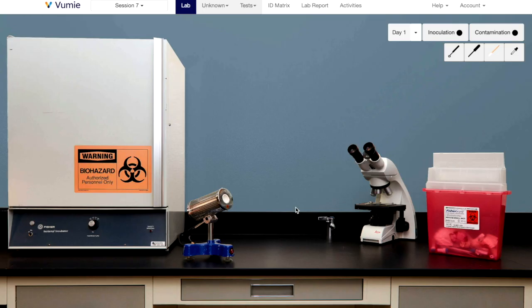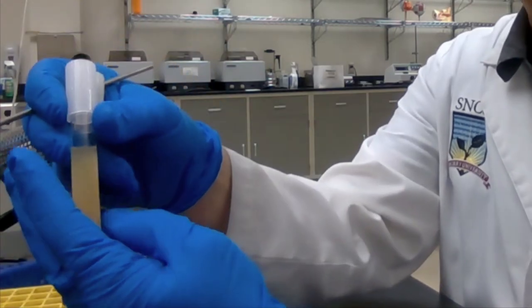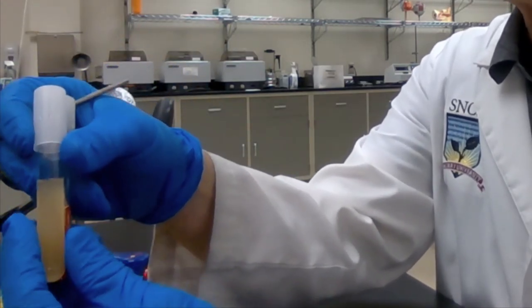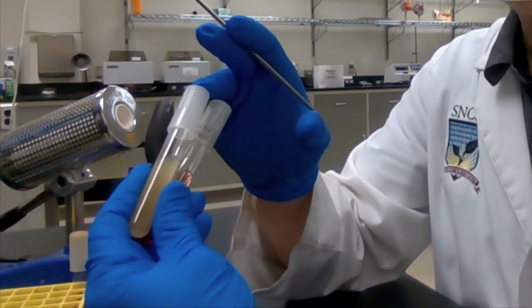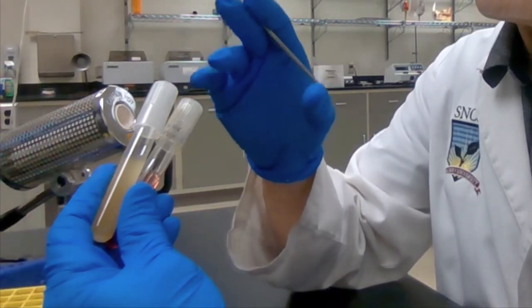This is a deliberate process that must be mastered to work in a microbiology lab. In a wet lab, this is done by picking up both tubes simultaneously in your non-dominant hand and using your transfer tool in your dominant hand.